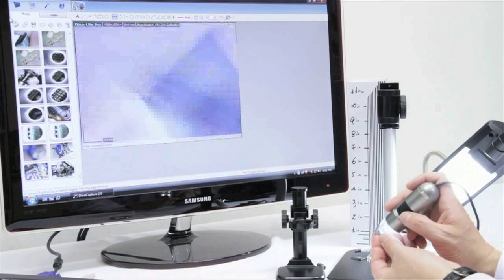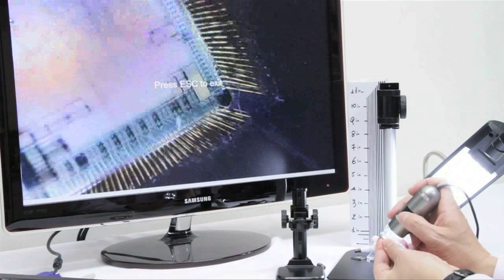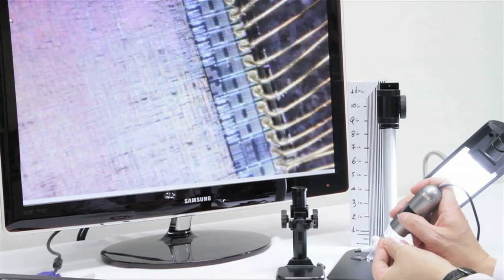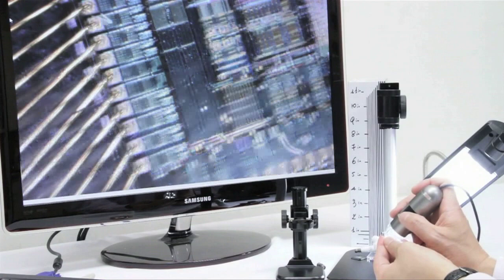Here we're looking at a PCB board and different chips under the microscope. We can easily travel to different spots because this is handheld. You can work at zero working distance, so it's steady when you press the microscope against the object.